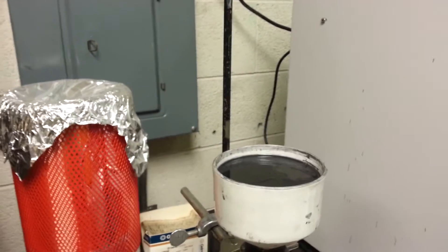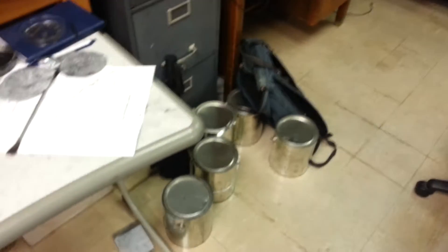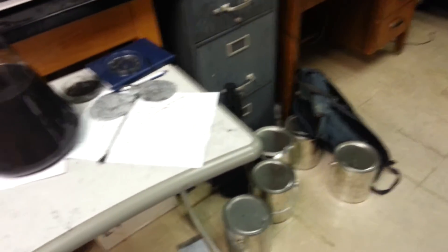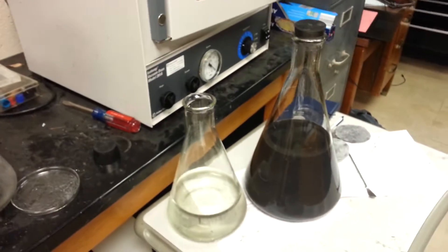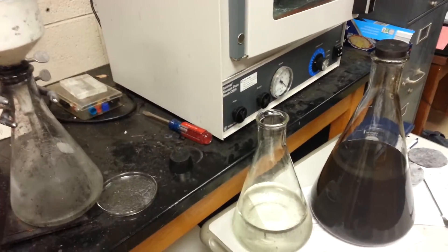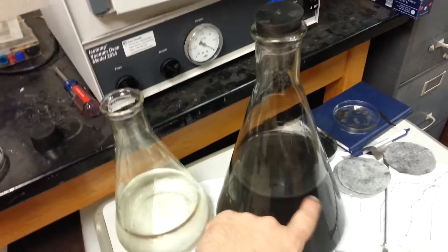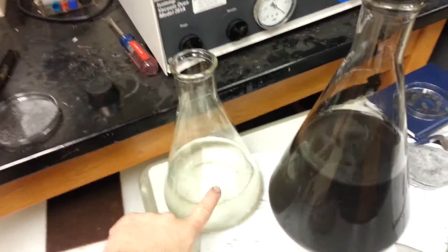That's actually what we're looking at buying — a filter press and a spray dryer for secondary processing, because I actually have to filter this fluid right here twice. I keep it in specialty paint cans from Lowe's because these solvents don't eat up paint cans, they don't react to it, and they seal up really well. The thing is, you want to make sure that you don't get any agglomerates. During initial testing we'd still get some agglomerates, so I use one kind of filter that filters a certain size and all those agglomerates go bye-bye. Then the next filter size filters the individual little flakes of graphene. So all you get here is just graphene in solution. That's the secondary filter — you filter it once to get to this, then filter it again to get the solution out and the cake out.